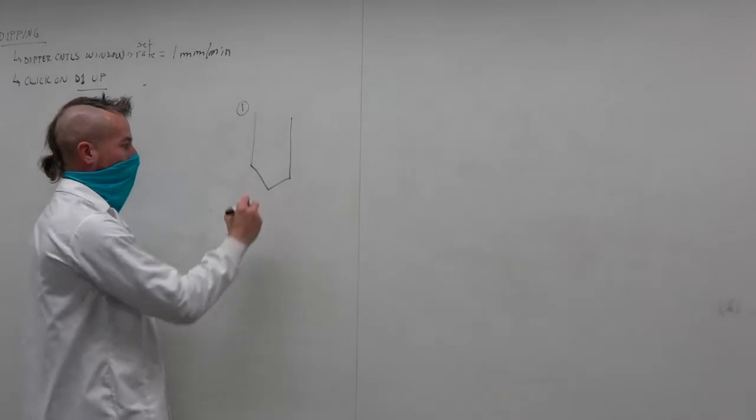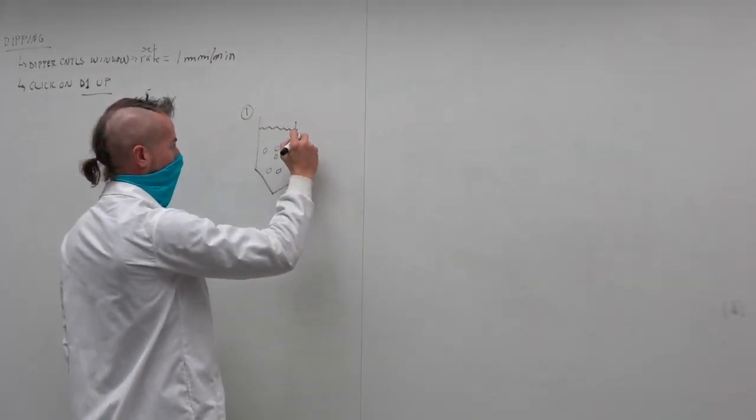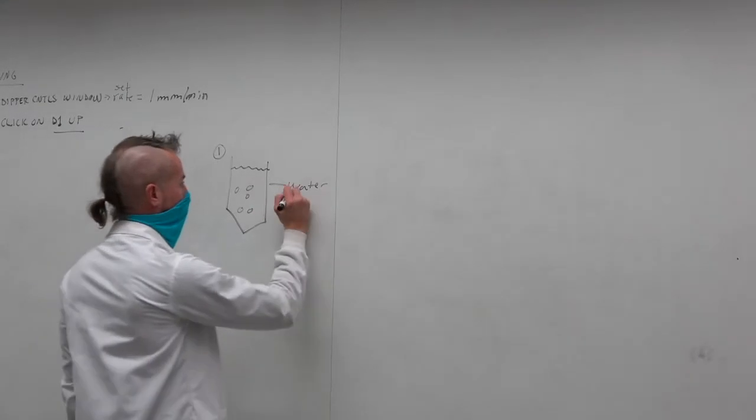So this is now particles in water to simulate blood.